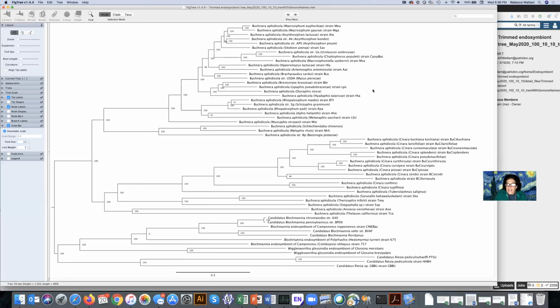In the last video, I'm going to show you how to find help on your tree, and where it describes the algorithms that we use, and talk about citing all these statistics that you'll need to cite in your tree, and how you credit us and the people who wrote the original parts of the tree pipeline that we combine in our pipeline.